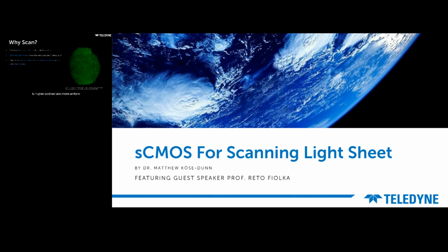Scanning light sheet can also lead to higher contrast and more uniform resolution over a wider field of view. This improvement with large field of view imaging is very important for high content or high throughput imaging of many sample variations or repeats, or simply when imaging very large samples, like centimeter scale mouse organs, that kind of thing. However, the benefit of larger field of view light sheet is only realized if you pair this technique with a large field of view camera and a large field of view microscope, because the imaging system as a whole will be limited by whatever has the least spatial resolution or whatever has the smallest field of view.